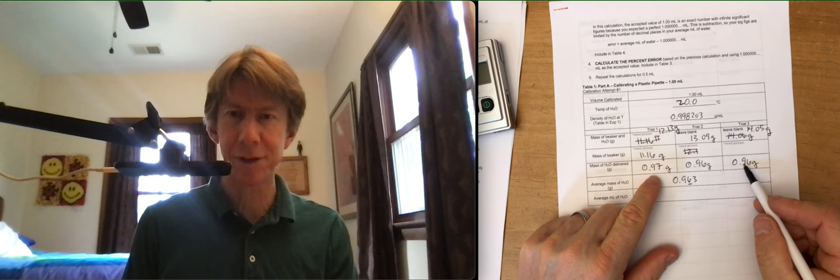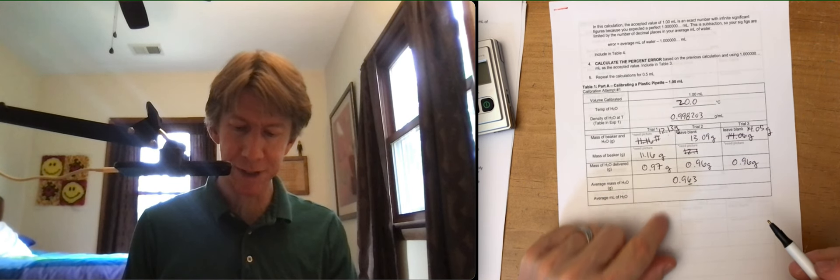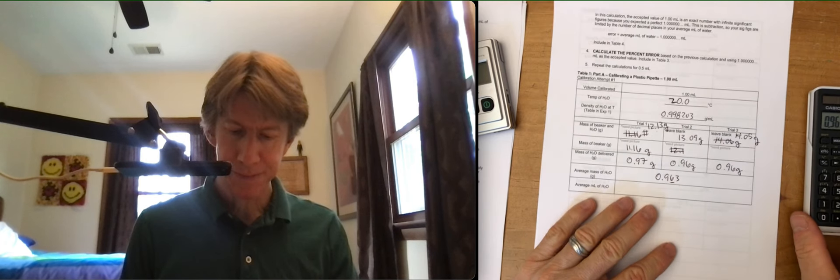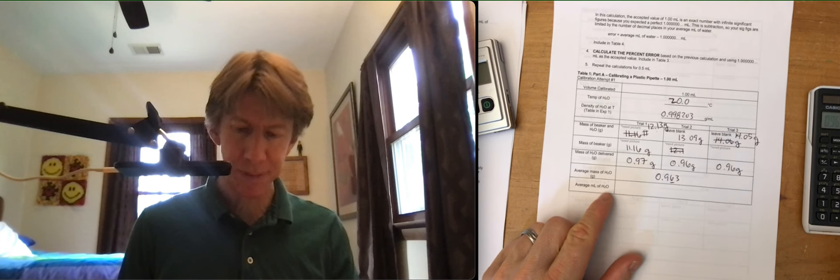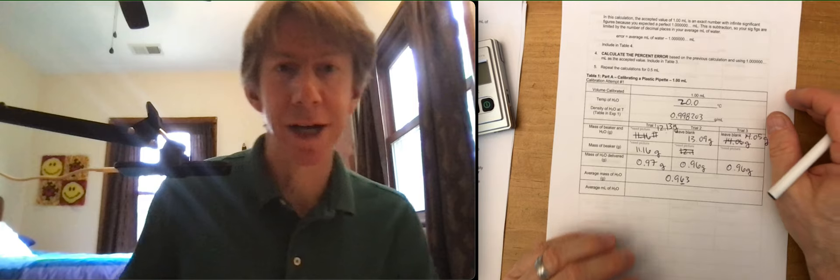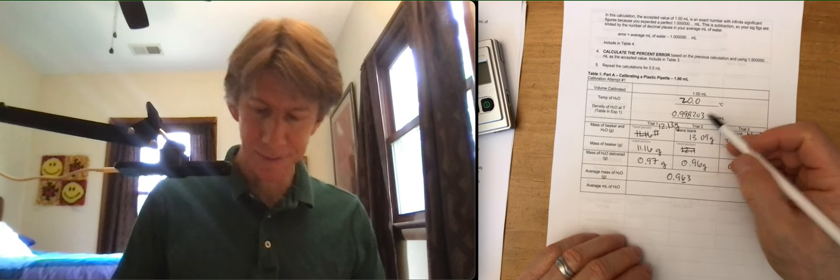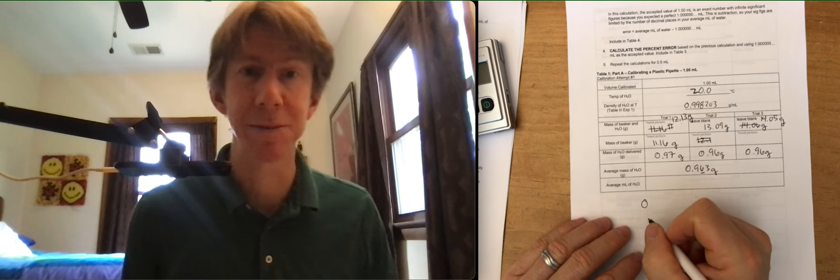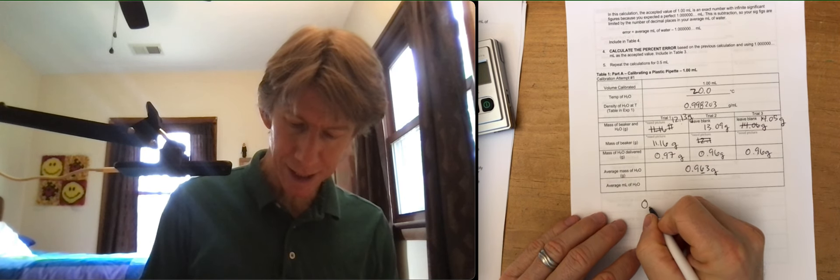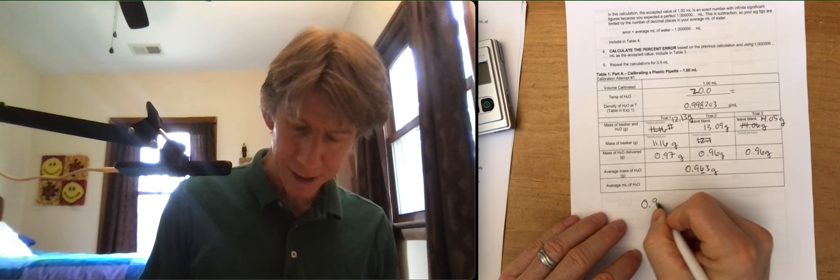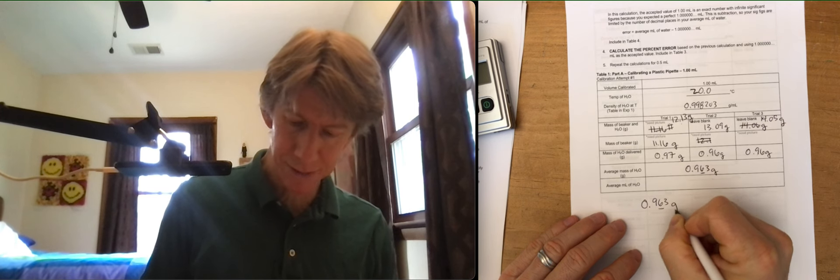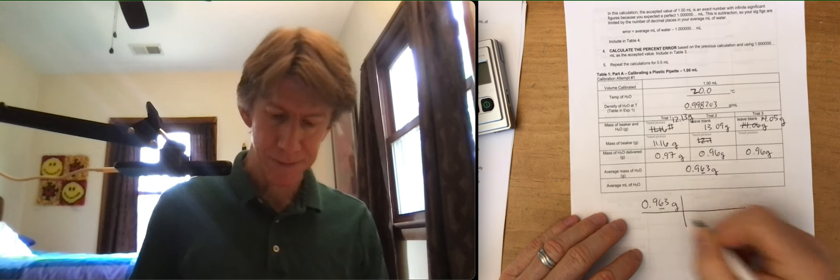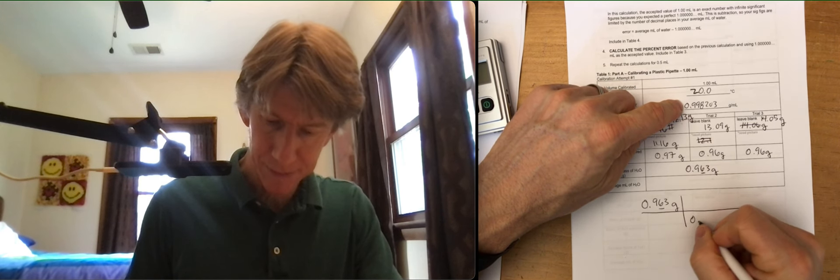Where I am, I have two sig figs in these numbers, so I'm only going to have two sig figs there. Average milliliters. Okay, so you have your grams. You have your density. Oh, those are grams, so I better put my units. I heart units. 0.963 grams.